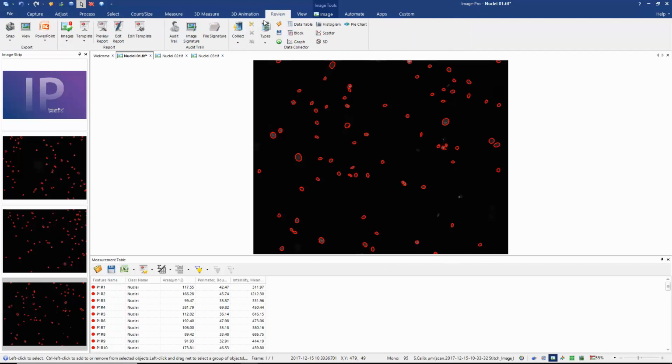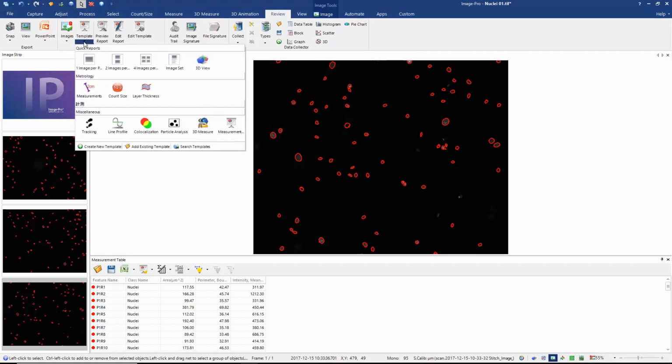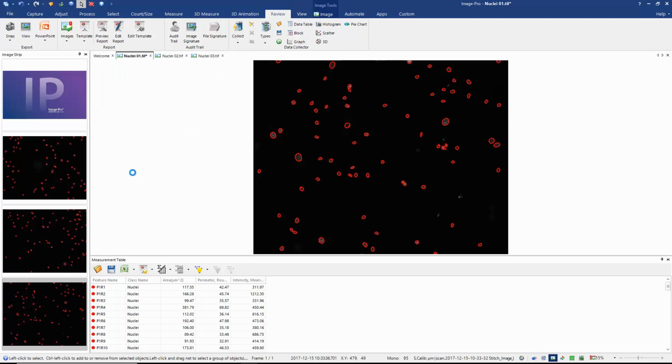So if we go to the Review tab, this is where we find the report tools. And if I click here under template, you can find that we have some predefined templates that you may wish to use. But what I'm going to do right now is choose to make a new template. I'm going to make a novel report.